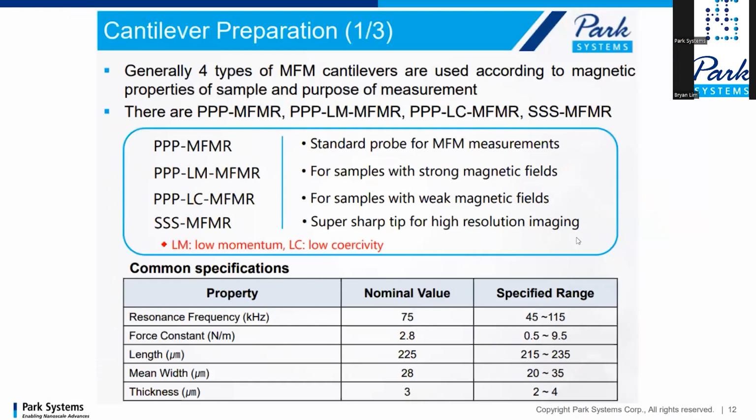So now let's talk about cantilevers. For MFM, generally there are 4 types based on the magnetic properties of the sample and the purpose of the sample measurement.